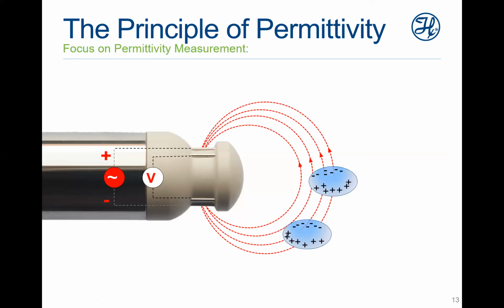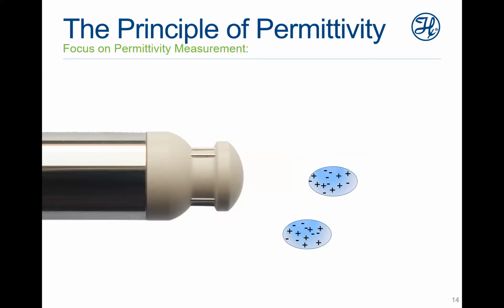And when we stop that, we get a relaxation of these ions, of this polarization, and that will lead to an electric pulse. And this electric pulse is linear to the cell volume, to the viable cell volume. That means the more cells we have and the bigger they are, the bigger is the pulse and the value of our measurement. I hope that's clear. This is in principle what we are doing with this kind of sensor.